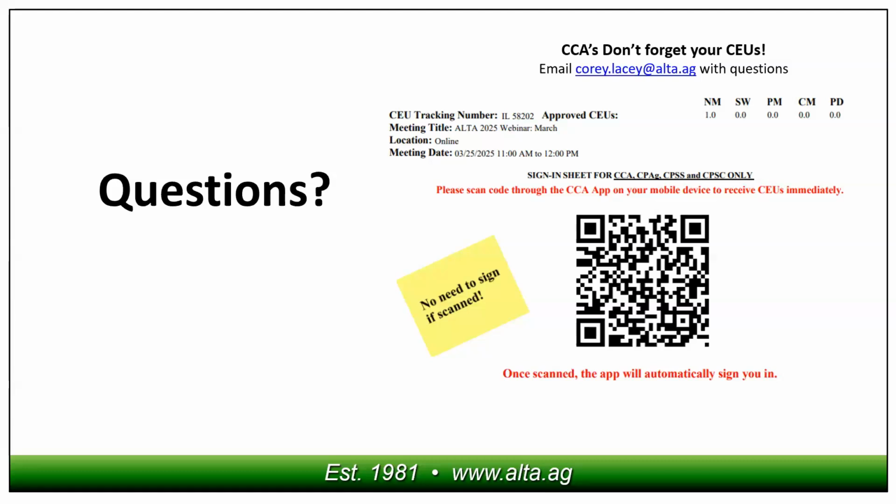Yeah, thanks, Corey. The bottom line is most of the flail mill grinders that soil testing labs use are just beating this stuff down to a pulverizing size, and everybody thinks they're getting 2 millimeter minus, and they probably are. But the problem is you get a wide variation in particle distributions. Yeah, 50% of the particles are below 1 millimeter, but you still have several large portions above that. And again, it's a function of texture. If you're in a sand, you're limited to basically the grain size of the sand and there's not much aggregation.